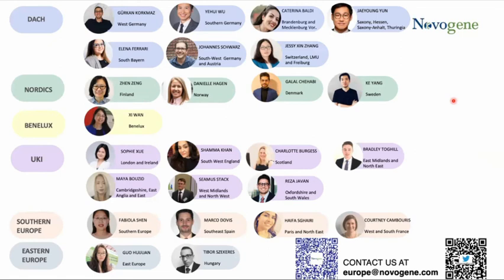Actually, I'll begin. Catalina Ramila asks, when you're looking at the FPKM distribution on the plots that you showed during your talk, do these represent each gene in the sample or the average FPKM per sample? It depends. If you are checking the FPKM in one sample, that will be the FPKM for each gene in that sample. And if you have multiple samples, and you define a group including multiple samples and want to see the FPKM for this group, then that will be an average FPKM for this group, calculated from multiple samples.